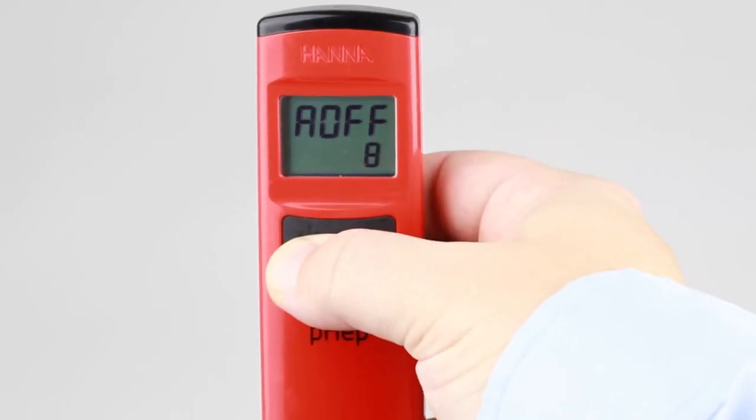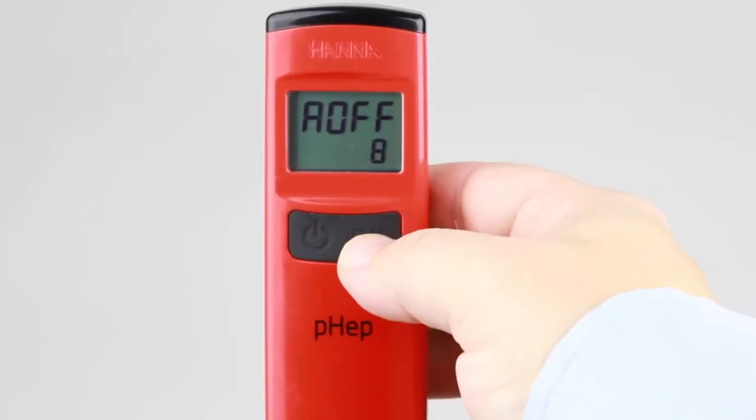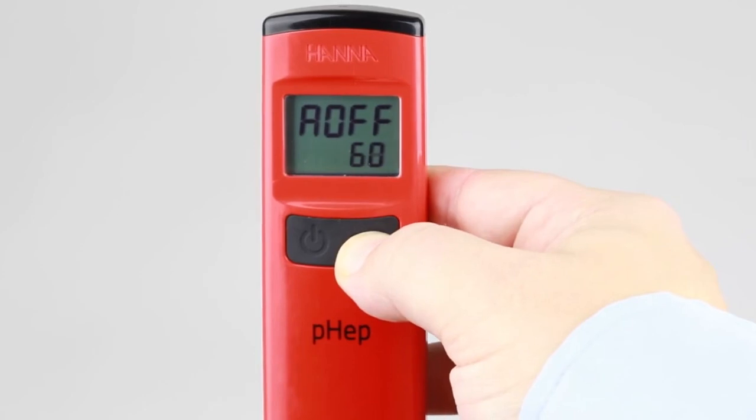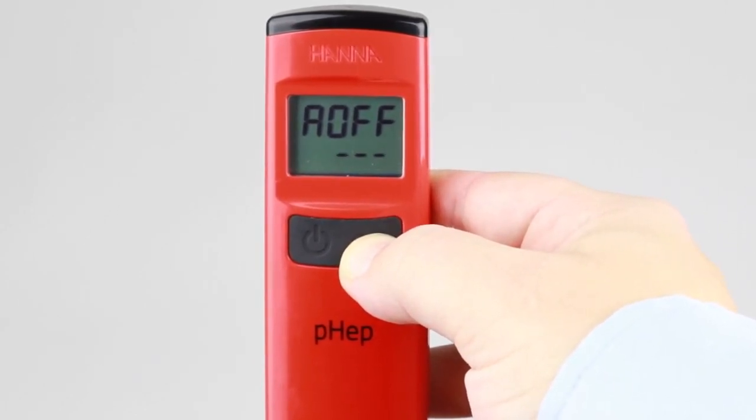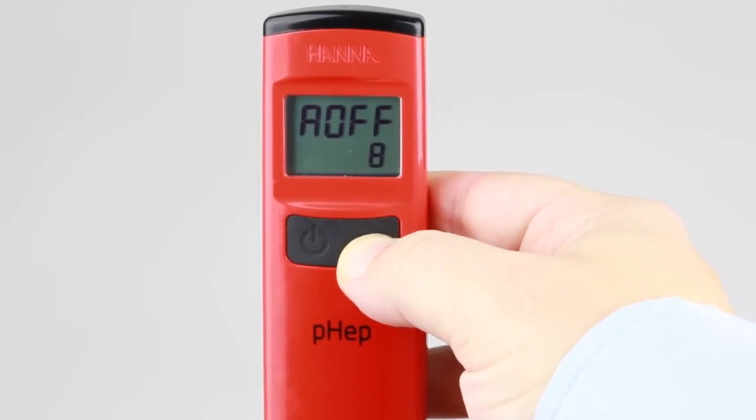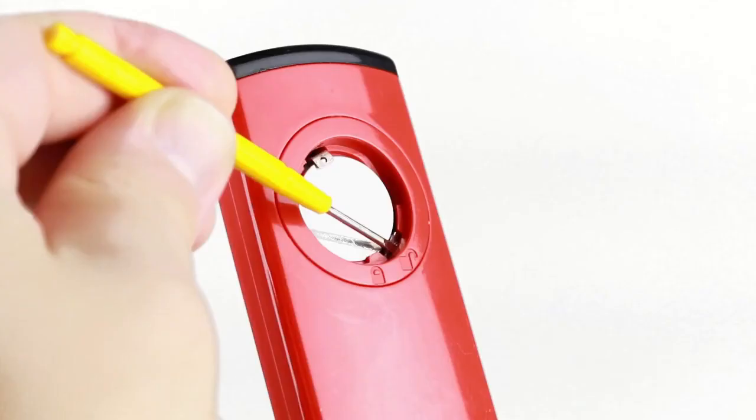Pressing the On-Off button moves to the next setup option, which is for automatic shut-off. The default setting is for 8 minutes. Pressing the Cal button cycles through to 60 minutes, then disabled, and finally back to 8 minutes. Pressing the microswitch again exits the setup mode and the meter is back in measurement mode.